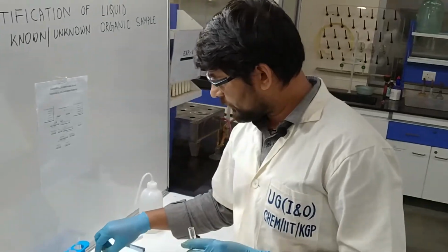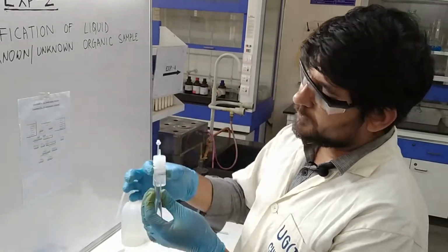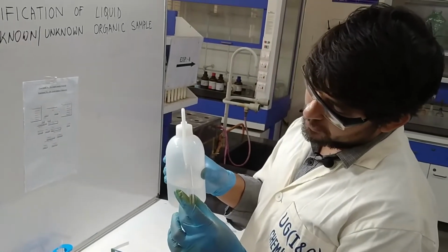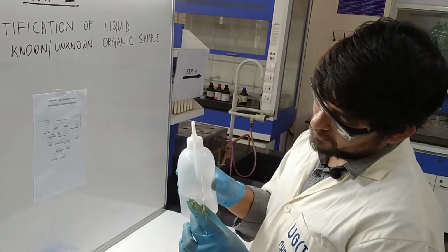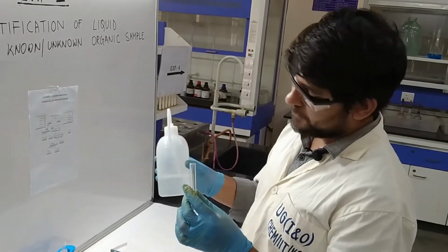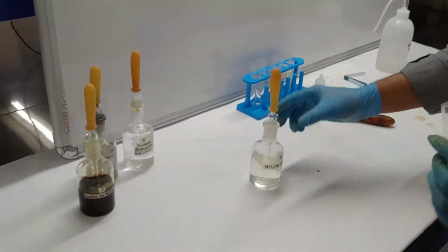So we have to take some sample, then we have to add some water, now here we have to add some NH4OH, ammonium hydroxide.